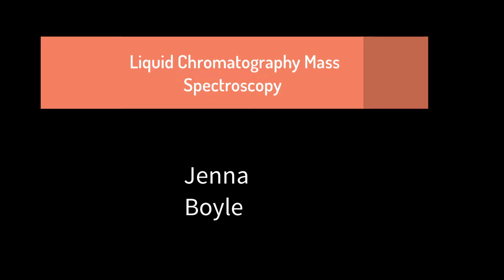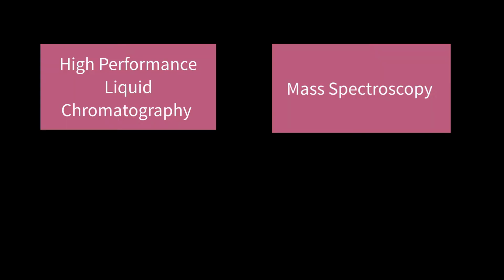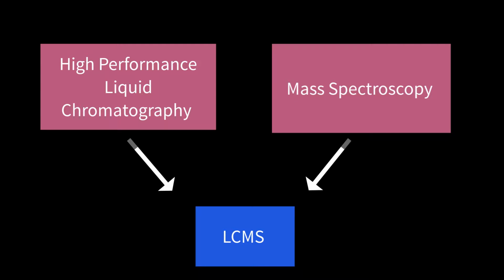In this video, I am going to teach you how to use liquid chromatography and mass spectroscopy to analyze and identify compounds. LC-MS is made up of two parts. The first part is high-performance liquid chromatography, and the second part is mass spectroscopy.